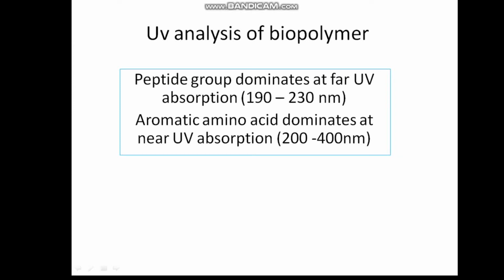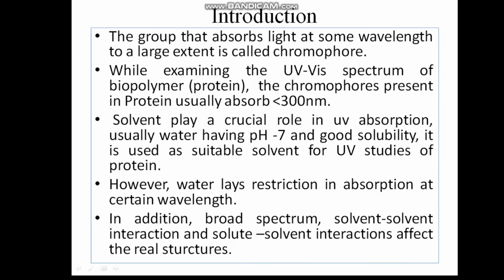Okay, in this video we talk about the UV analysis of biopolymer, meaning how one can understand or inspect the presence of biopolymer in a UV spectrum. Now, the biopolymer, for example protein, usually when kept in a UV spectrophotometer will absorb light at some particular wavelength.